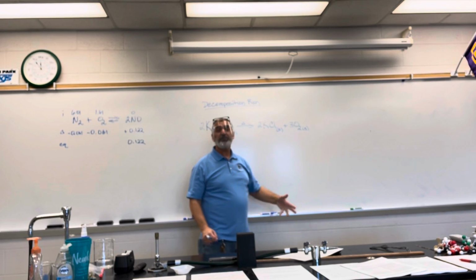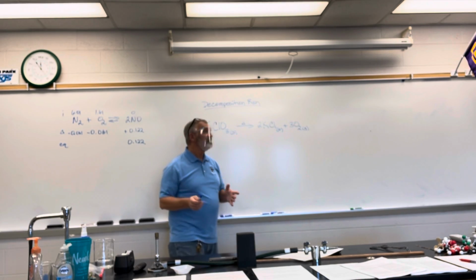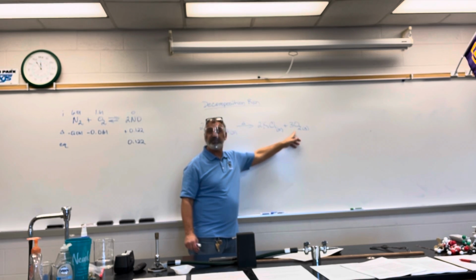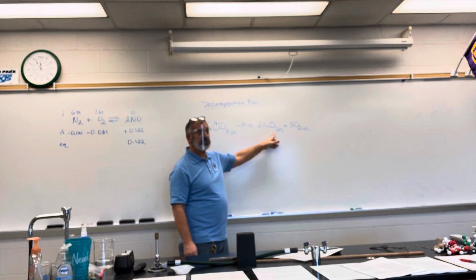So what does percent mean then? The fraction, the part over the whole, right? What part are we interested in this lab? The oxygen, right? So how can we get the mass of the oxygen? How do I get this mass? Subtract from the total, for how much it goes down by, right? Because this is still a solid, so it's still going to be in our crucible.